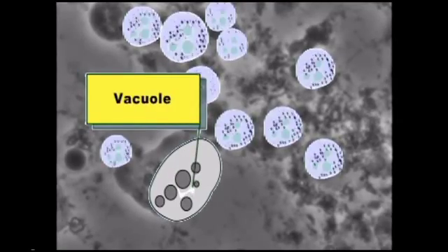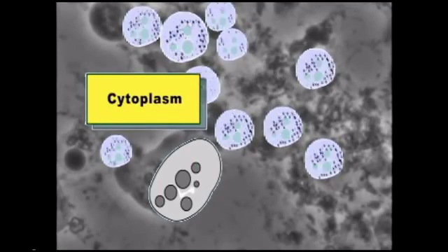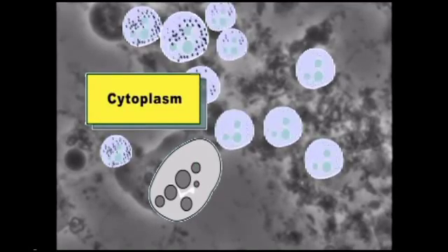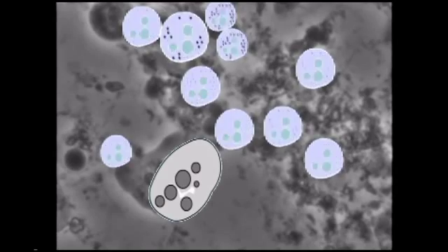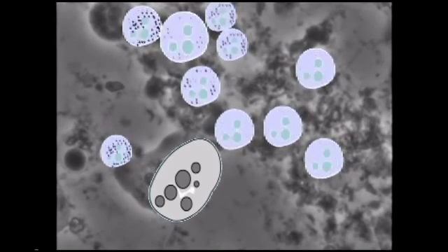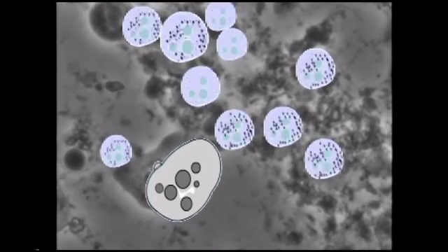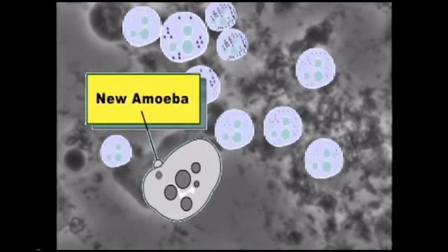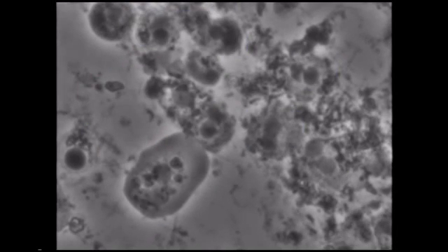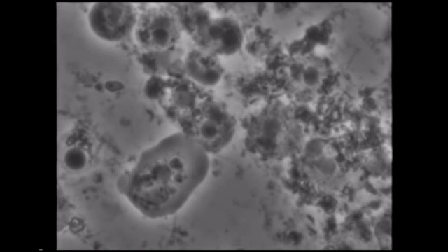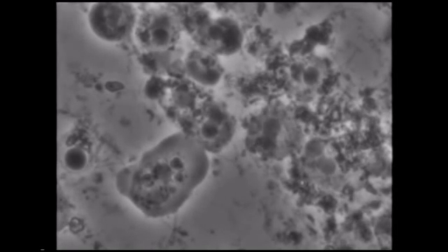This is the nucleus. The white spot is called a vacuole. The cytoplasm does not effervesce. They move by what's called a pseudopod, or in other words, this blob bulges out in one direction or another and it slinks that direction. This one will take a nucleus and cytoplasm and make a whole new amoeba. This is the only video I've seen of an amoeba giving birth.